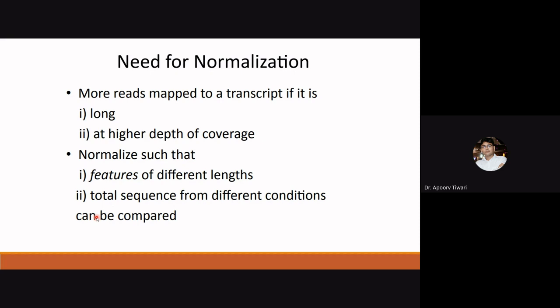After differential analysis, we can go for normalization of our data. Actually, why do we need normalization? More reads map to a transcript if it is long.